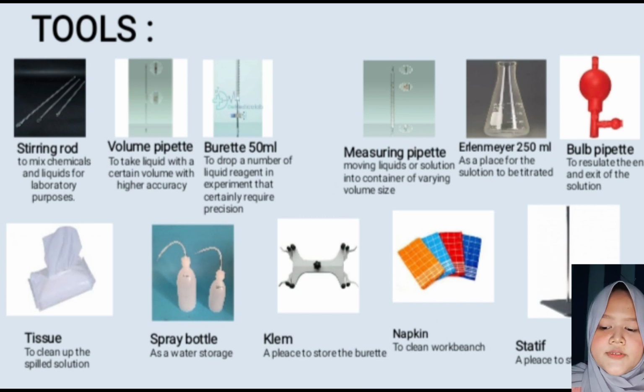Tissue, for use: clean up spilled solution. Spray bottle, for use: a water storage. Clamp, for use: place to store the burette. Napkin, for use: clean workbench. Stative, for use: place to store the burette.